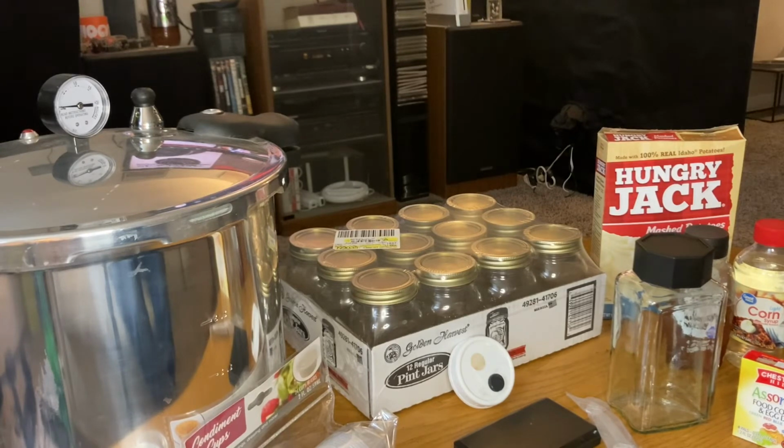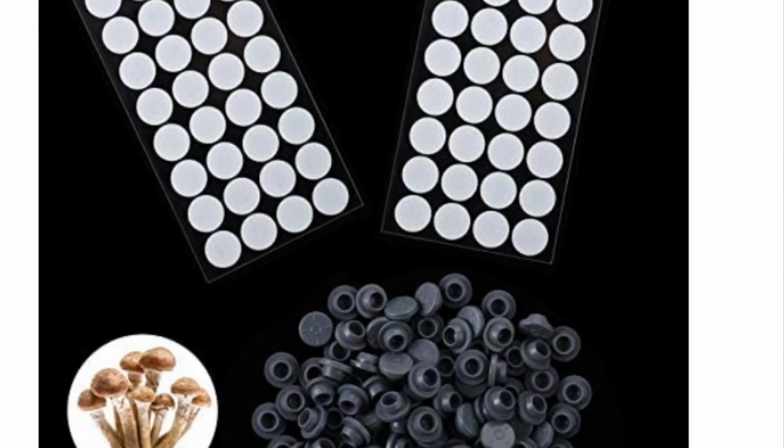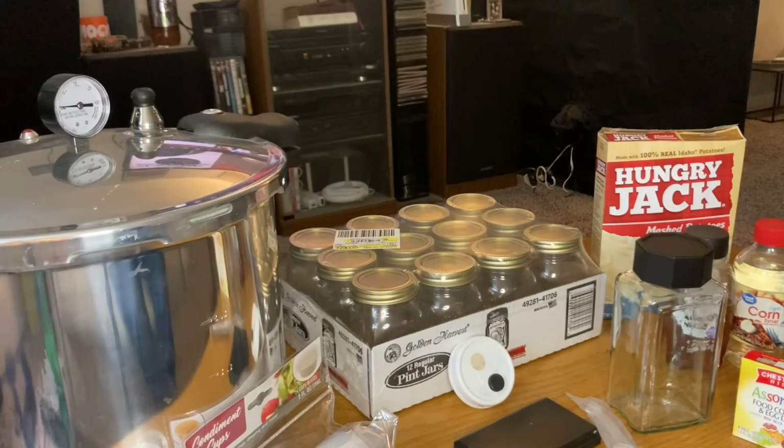And then from there you just order online some micro pour tape basically, or stickers, and some self-healing injection ports. And then you just drill some holes and attach those to the top of the lids, and you have your rye berry lids, or your rye berry jars as well.